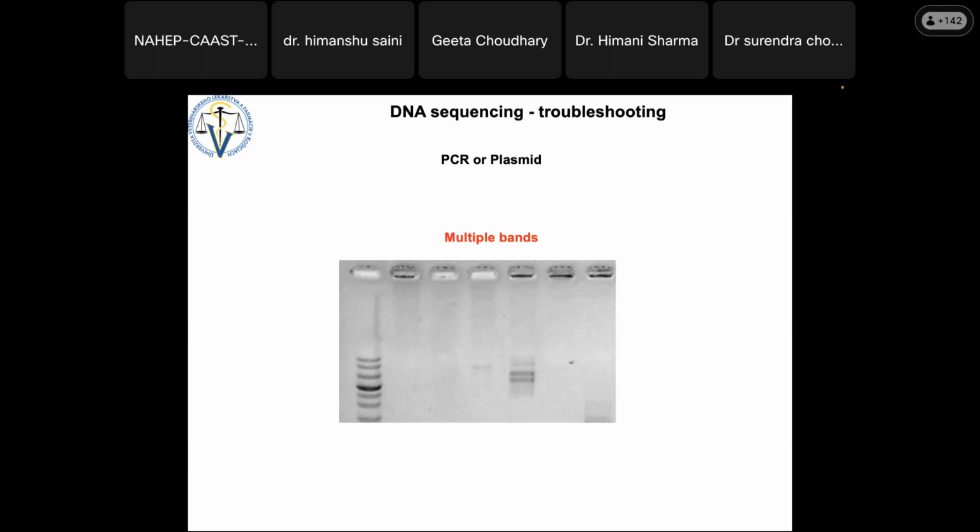You need to take that gel out, because with the pipette you are not able to take out that gel. The gel will just entangle in that tip, and you have to release the gel. So you just put the tip, yes, into the gel, and release that gel into the master mix. Sorry, the tip and needle combination. How to use it?